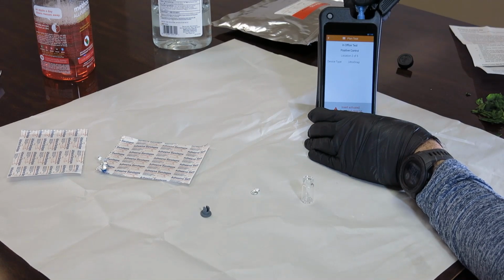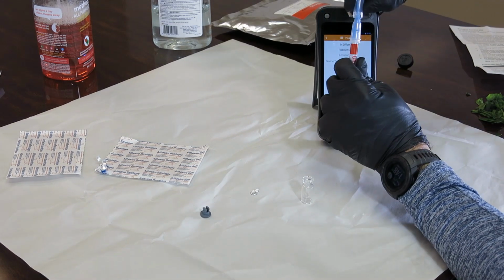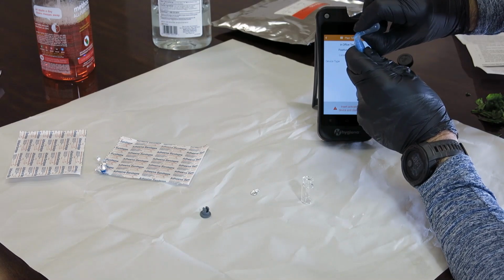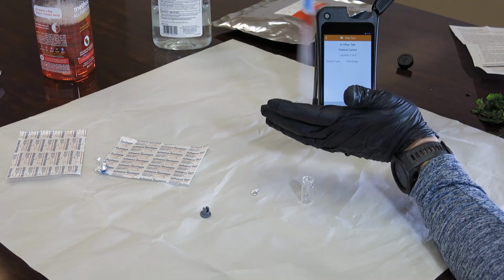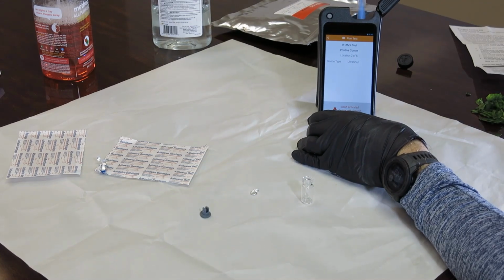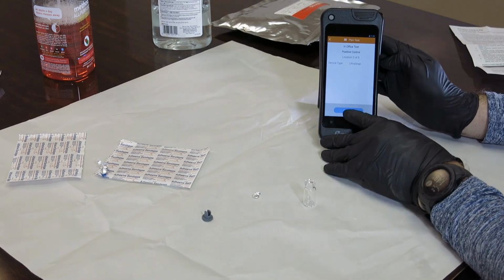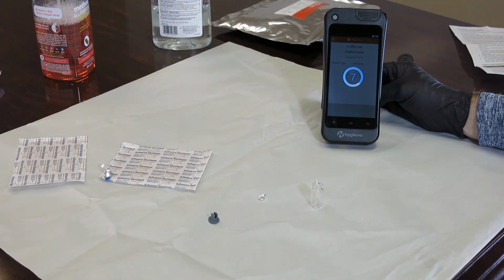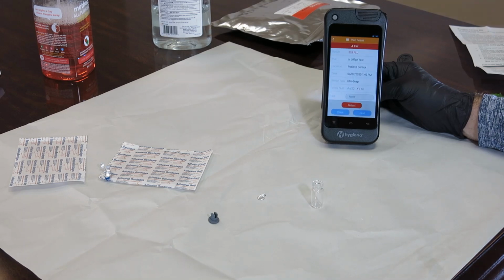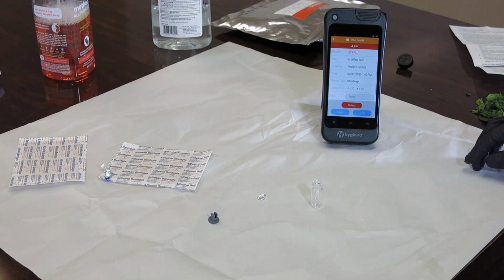We're going to snap this, squeeze this in here, give it a little shake to get the reaction going, put it in here, run the test. And we get a positive reading of 353 RLUs.